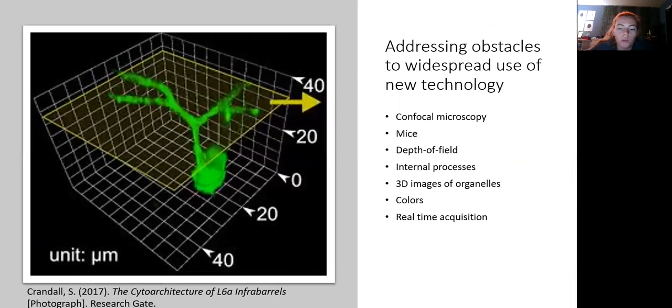The multimodal microscope used near infrared fiber lasers, and these gave out four spectrally separate signals.